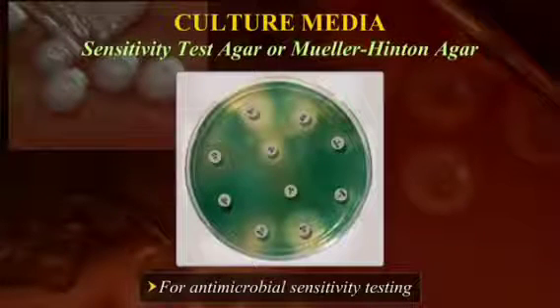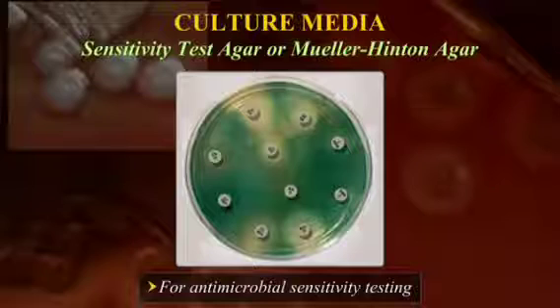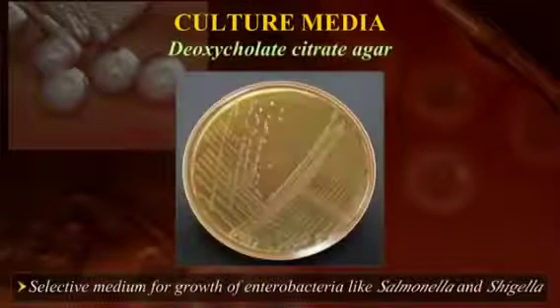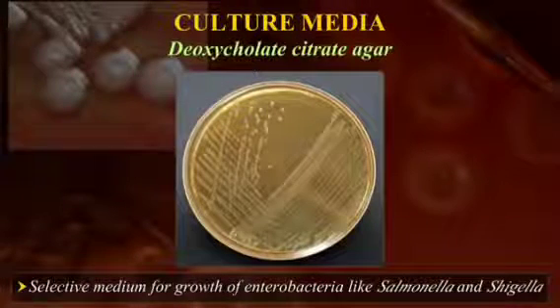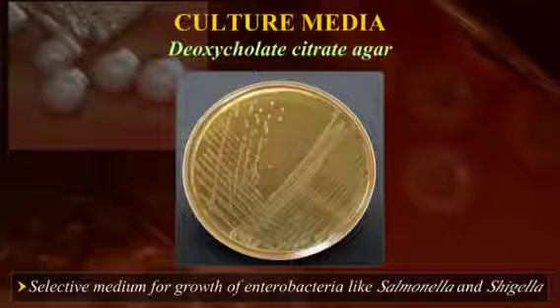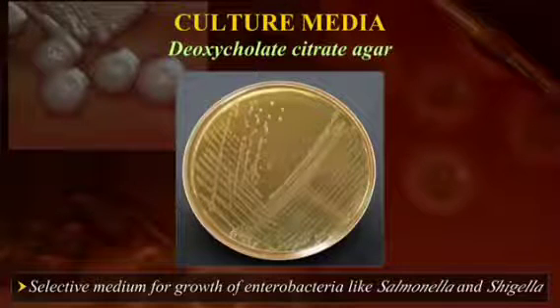Sensitivity test agar or Mueller-Hinton agar is used for antimicrobial sensitivity testing. Deoxycholate citrate agar is a selective medium for growth of enterobacteria like Salmonella and Shigella.